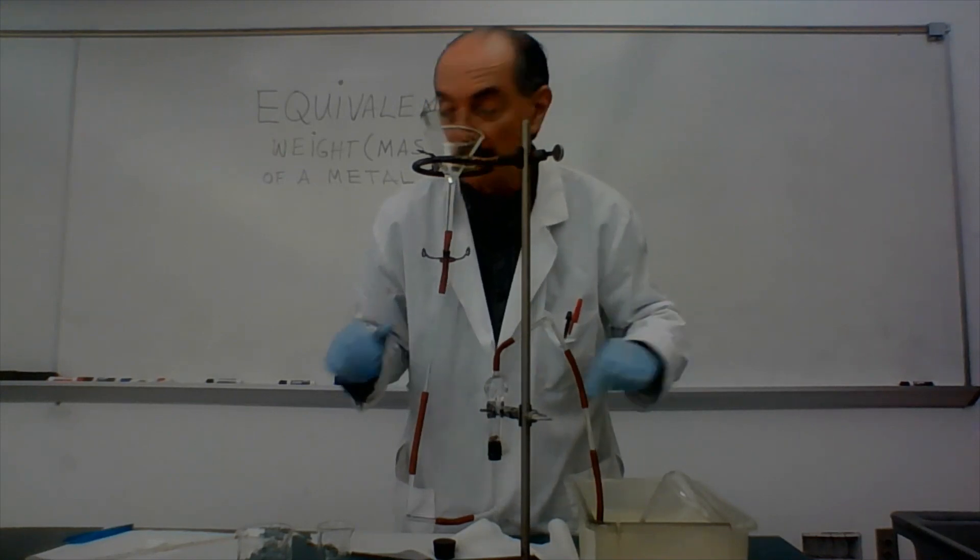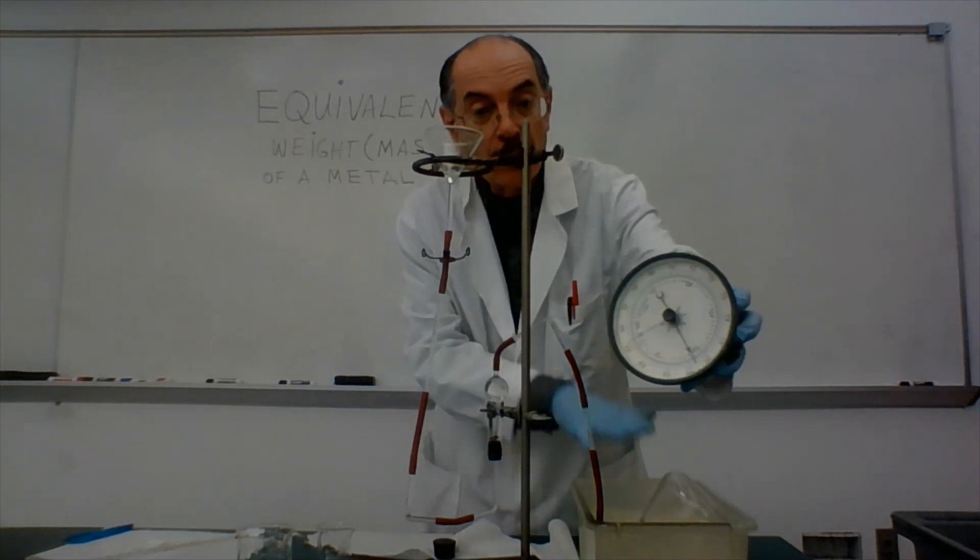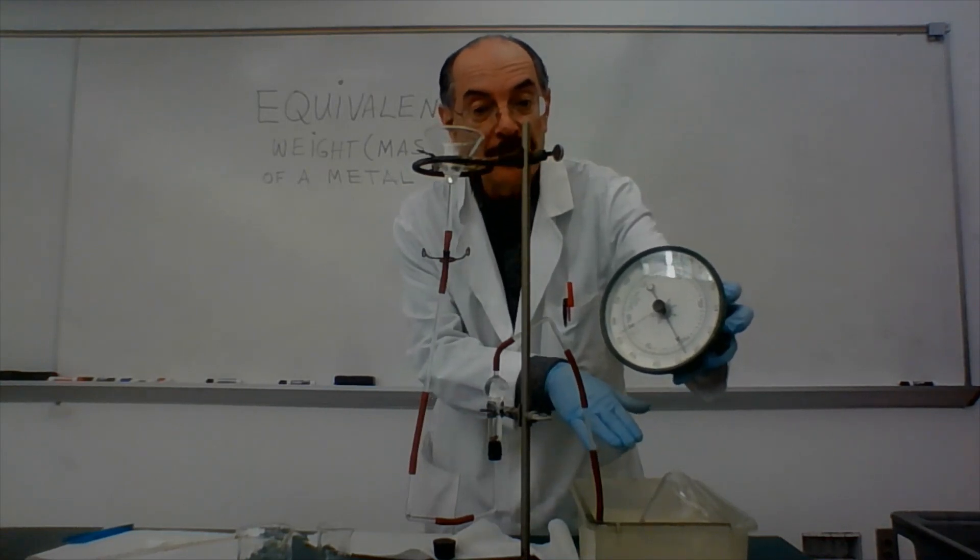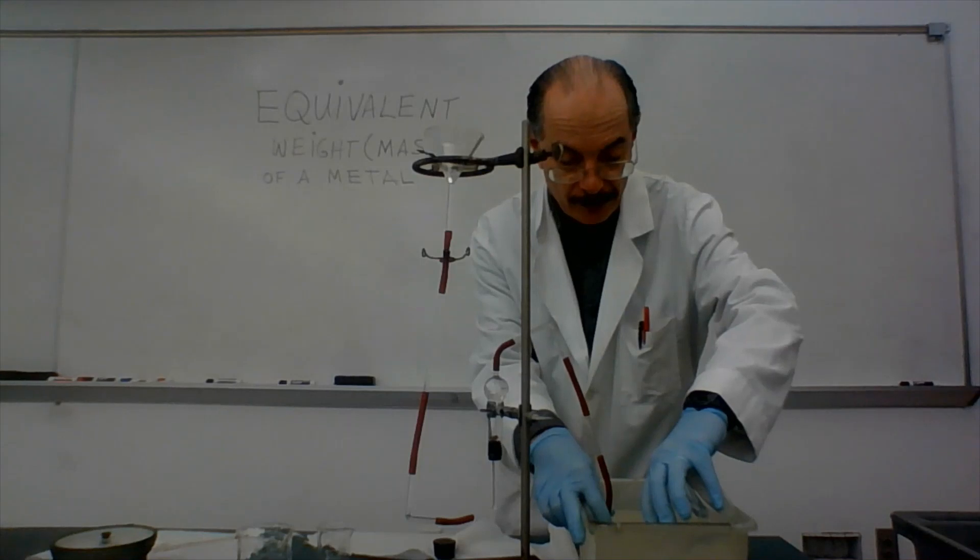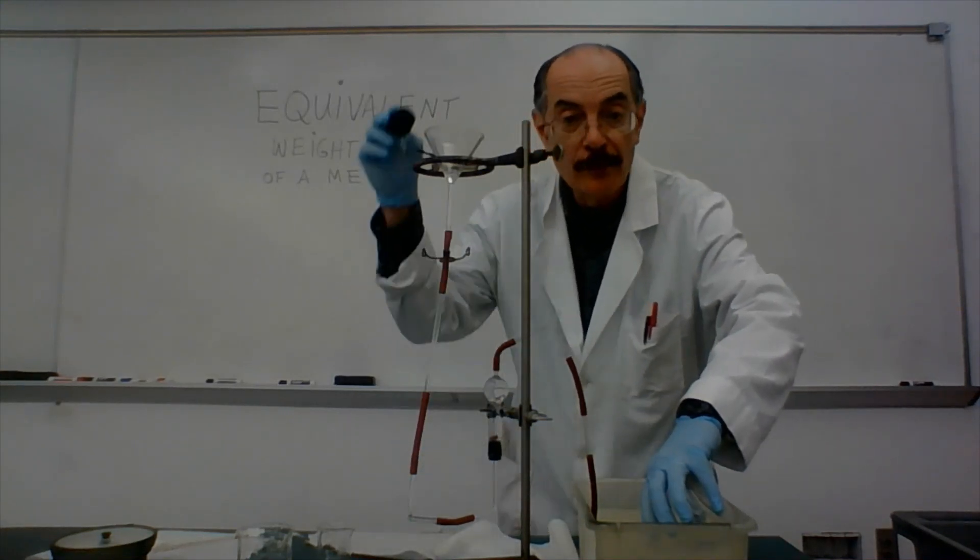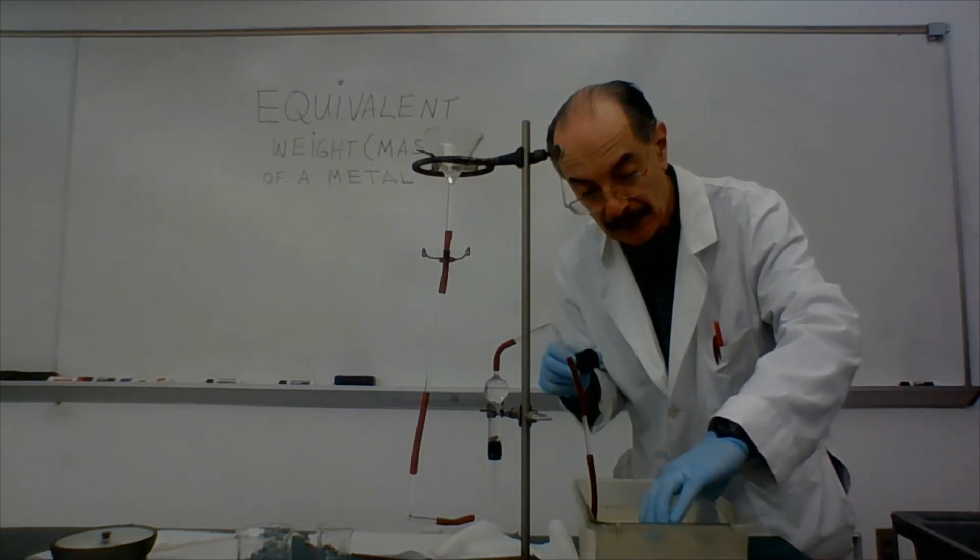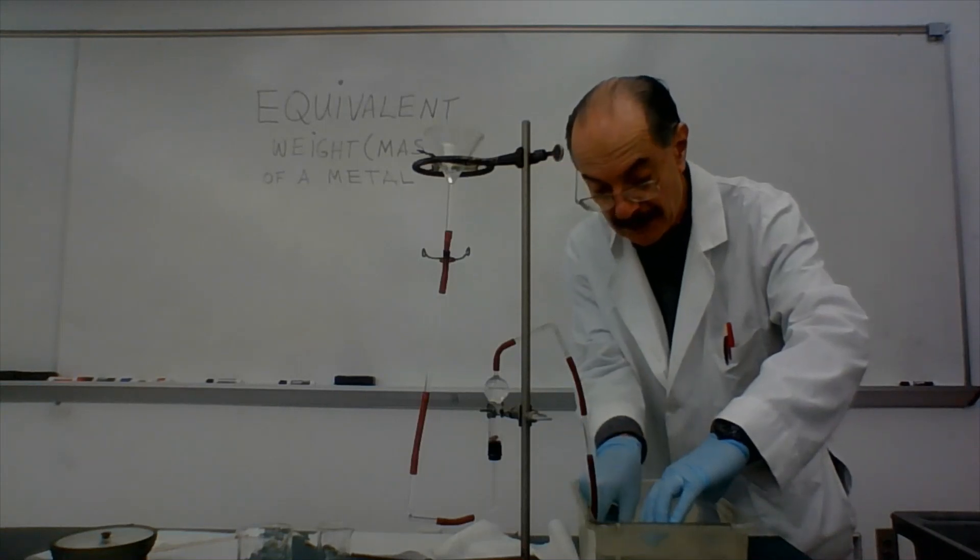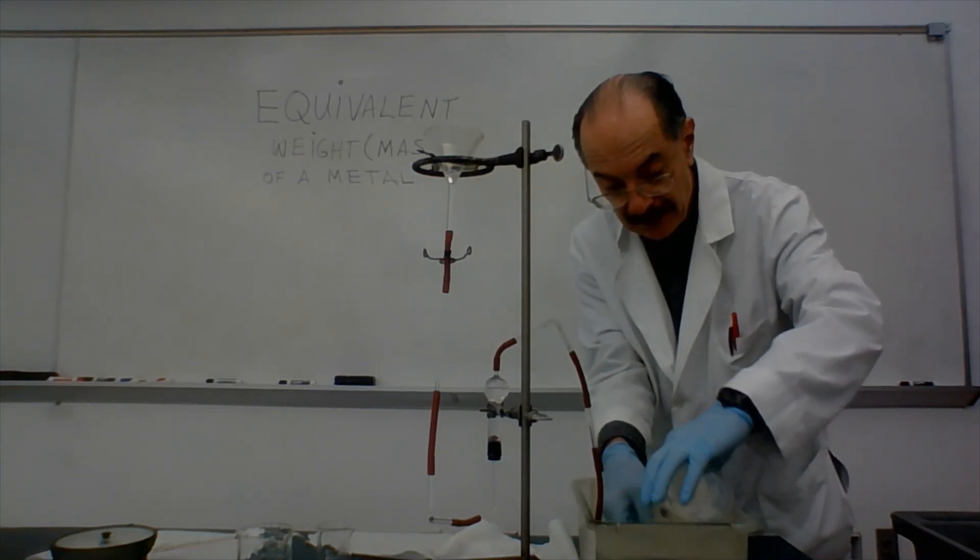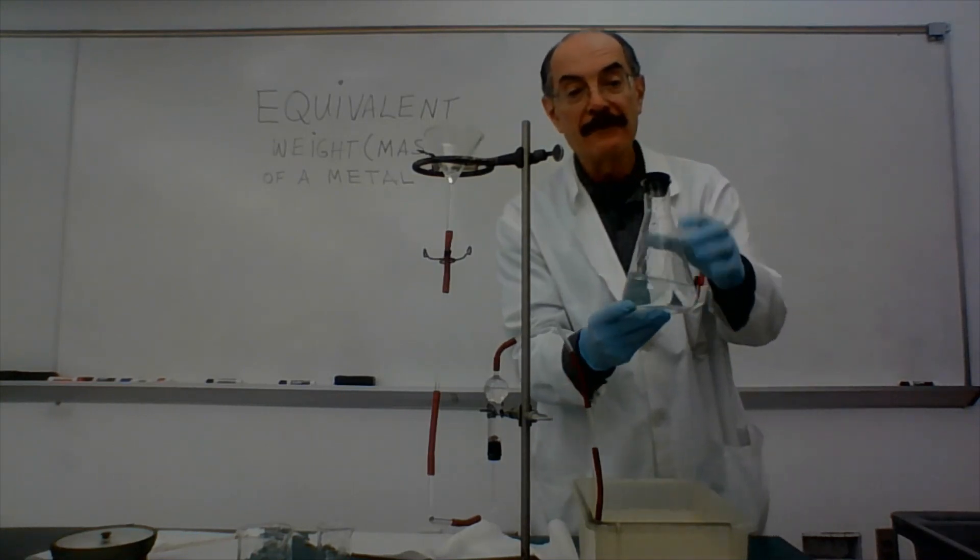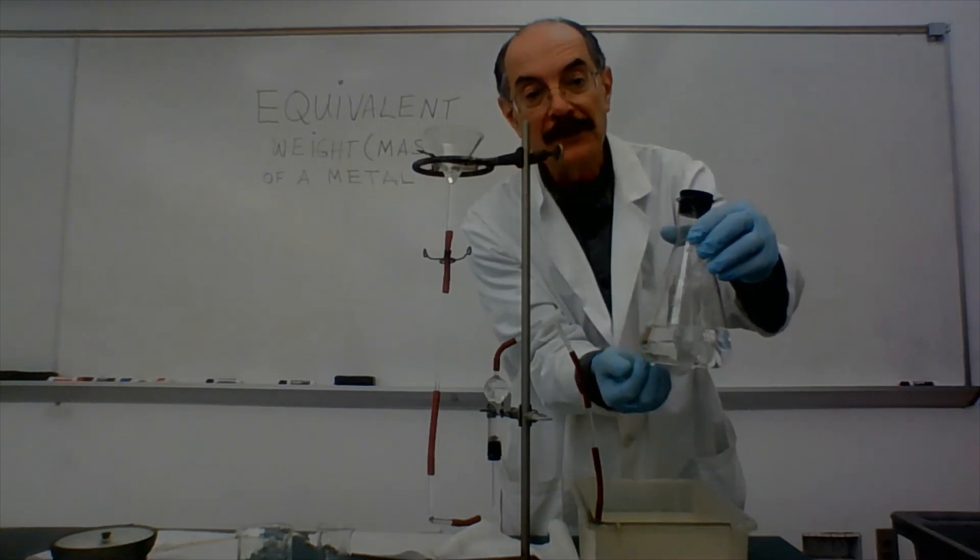So what I need to do is equalize the pressure. Remember that we're going to use a barometer to register the pressure of air on the water here. So we want to equalize that with the pressure of the hydrogen inside the flask. So what I'm going to do is I'm going to hold the flask very carefully, very carefully remove the little tubing from here. Once more, bring in my rubber stopper. And what I'm going to do now is I'm going to tilt the flask. I'm going to tilt it until the water inside is at the same level as the water on the outside. And once it's there, I'm going to slip in the rubber stopper and cover it and then pull it out. And at this point, what I have is, as you can see, there's residual water and over here would be hydrogen, of course mixed with some water vapor, which we'll have to compensate for later on.